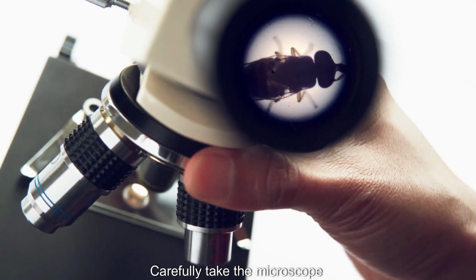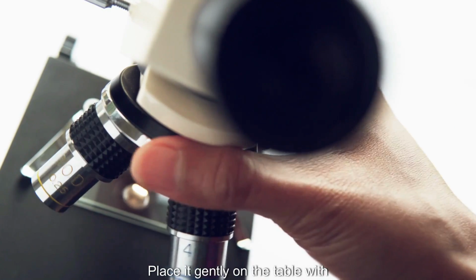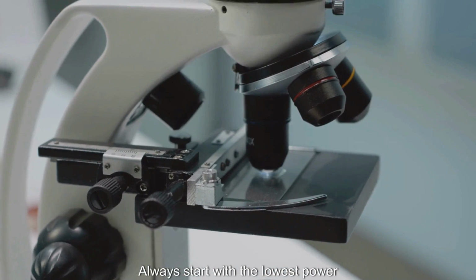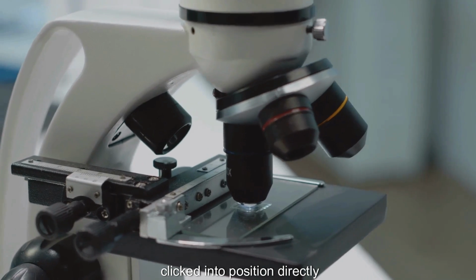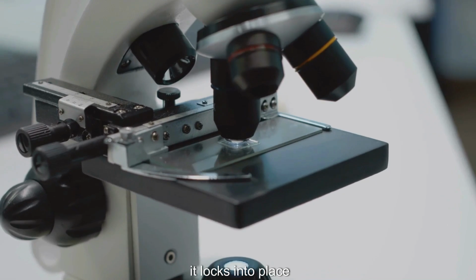Carefully take the microscope out of its box, holding it with two hands. Place it gently on the table with the arm facing you. Always start with the lowest power objective, which is the shortest one, clicked into position directly over the hole in the stage. You will hear a little click as it locks into place.